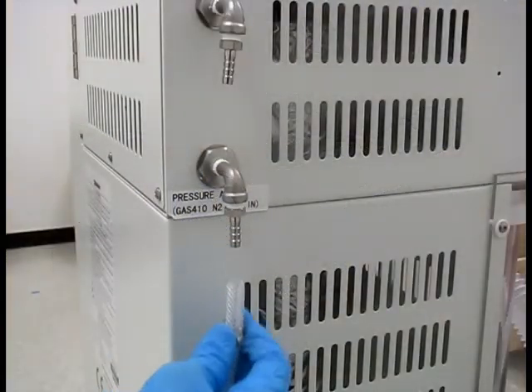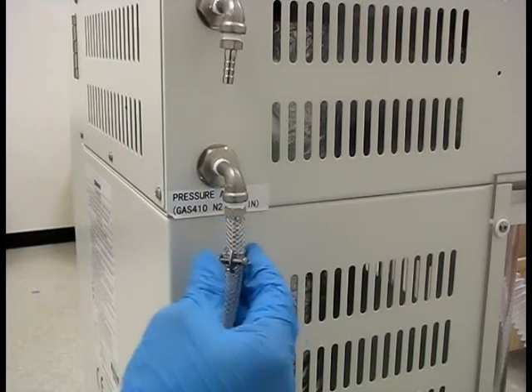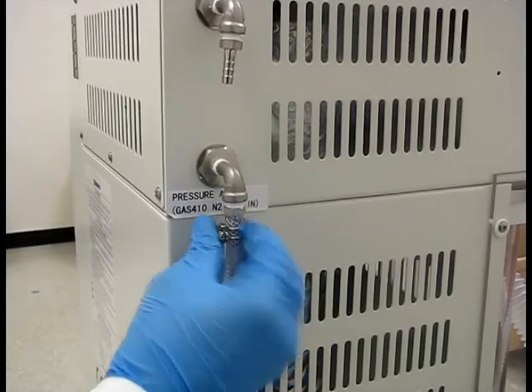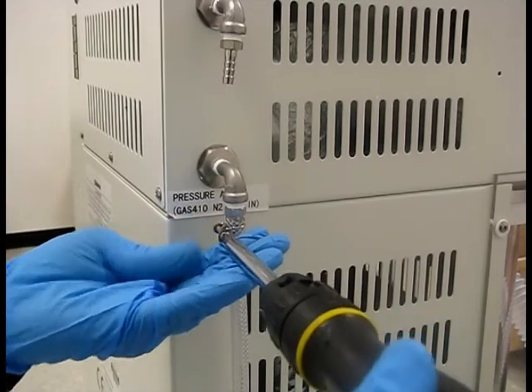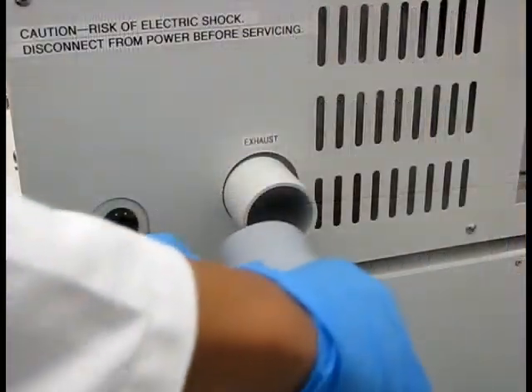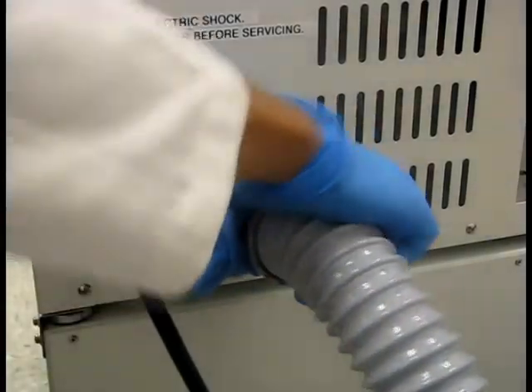Attach the pressurized air hose to the air intake port labeled 'Pressure Air In, GAS 410 N2 Gas In.' This hose connects to your air compression system. Finally, attach the exhaust hose to the exhaust port located on the back of the unit.